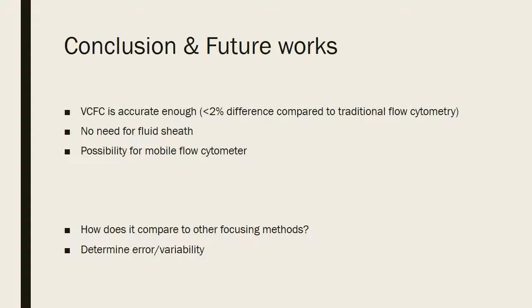In conclusion, VCFC was shown to be accurate enough that its results were less than 2% different from traditional flow cytometry utilizing a fluid sheath. Therefore, they eliminated the need for fluid and opened up the possibility for a mobile flow cytometer that can be taken into the field for environmental monitoring and medical diagnosis for remote populations.